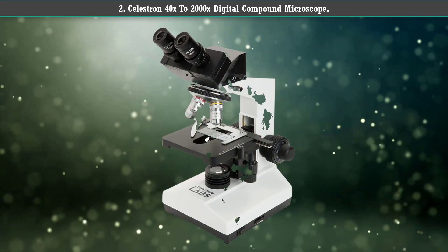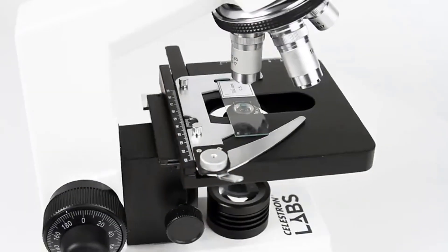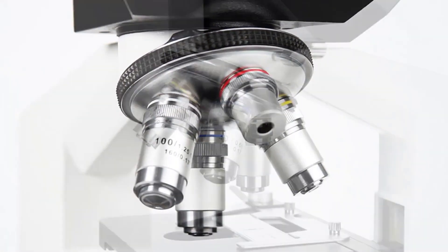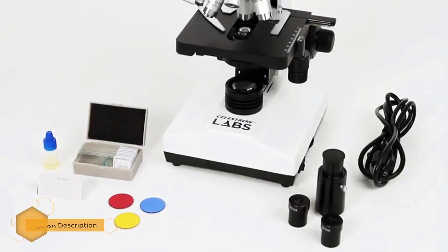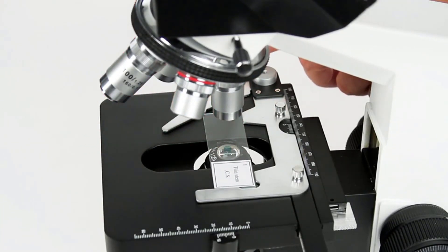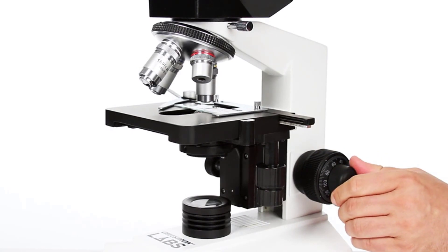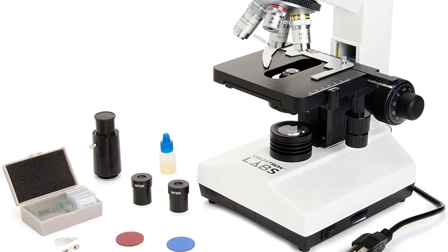Number 2: Celestron 40x to 2000x Digital Compound Microscope. This microscope features interchangeable eyepieces in varying magnifications, four achromatic objective lenses, a durable all-metal construction, a built-in light source, condenser, and iris diaphragm, and a high magnification range of 40x to 2000x. It comes in various styles and specs, and can even be purchased with an attachable smartphone adapter, so you can conveniently take images and videos of the specimen right through your mobile phone.